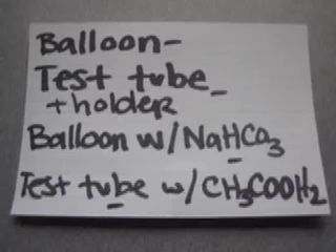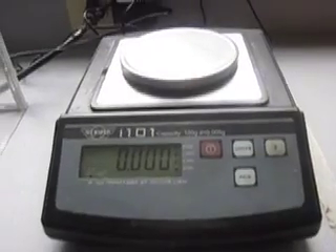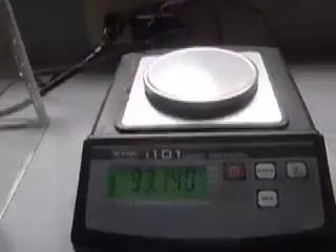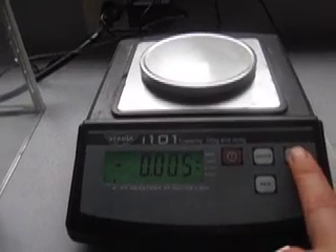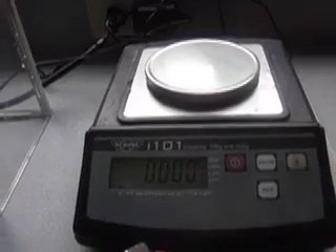First things first, we will take the mass of each one of these things that I just showed you. We have this fancy scale and I have to make sure that it's zeroed — it is already at zero, but I'm going to hit zero again. Sometimes if we do things like hit the top of it, it becomes off balance and we have to hit that Z again for zeroing.